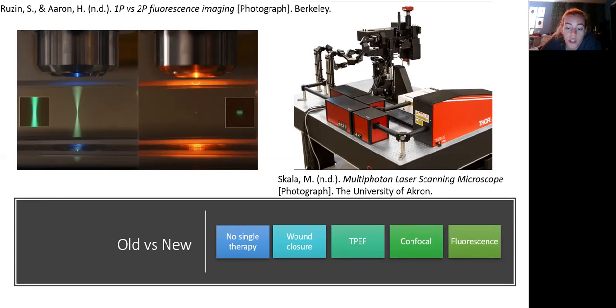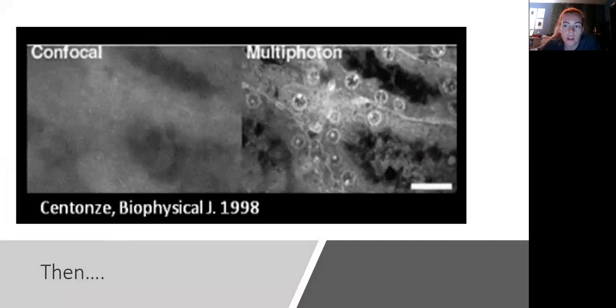So the difference is that the two-photon excitation fluorescence machine was better at studying and evaluating epithelial tissue without needing a stain. Whereas the multi-photon microscope uses this optical redox ratio that computes numbers based off of the intracellular concentration. So the dynamics are still not 100% understood for cellular metabolism, but it's a step in understanding how the longevity of each of them works.